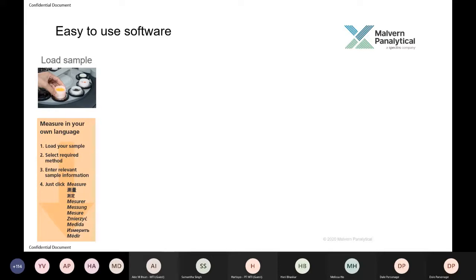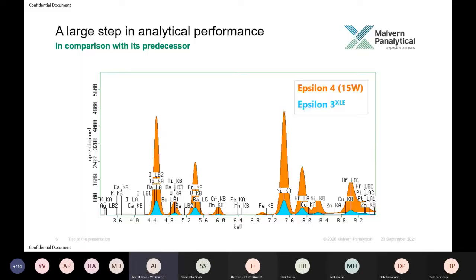Okay, so as I said, it's easy to use, it's got flexibility. Bel, could you please go back to the previous slide on the competition?